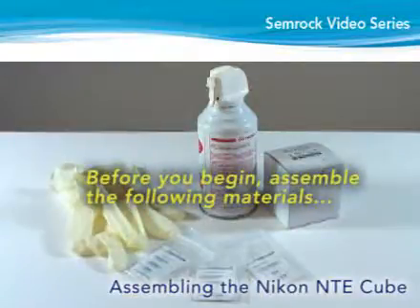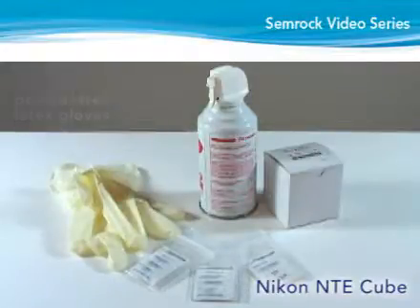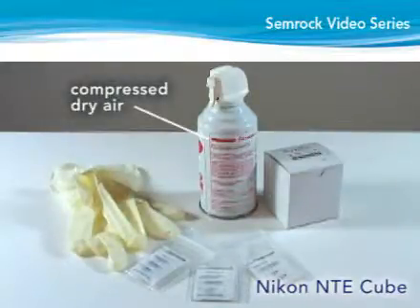Before you begin, assemble the following materials: powder-free latex gloves and a bottle of dry compressed air.